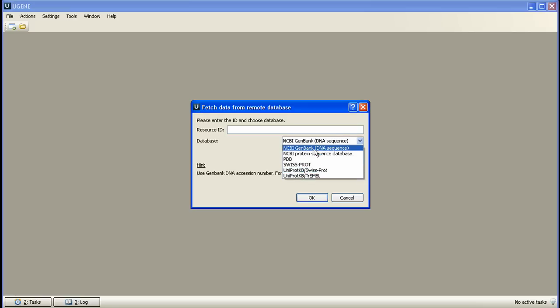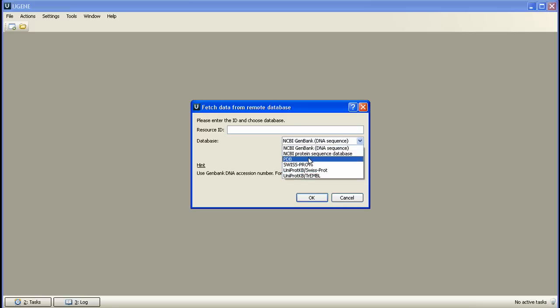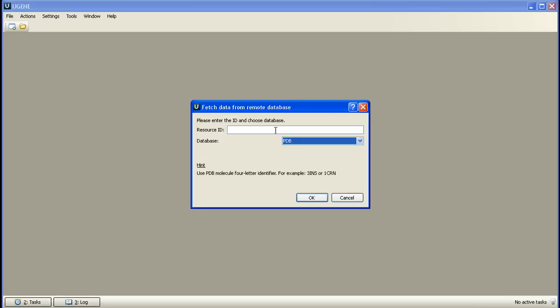Let's open a file from Protein Database or PDB first. The hint line, which is placed below the database pull-down, suggests the format of the identifier. For PDB it has two example IDs. Enter one of them.